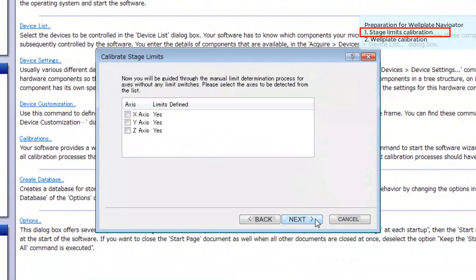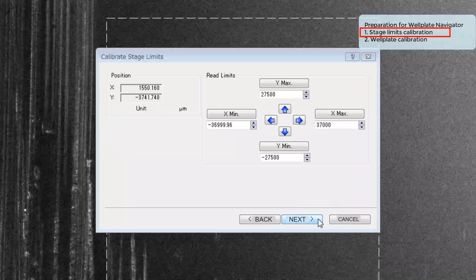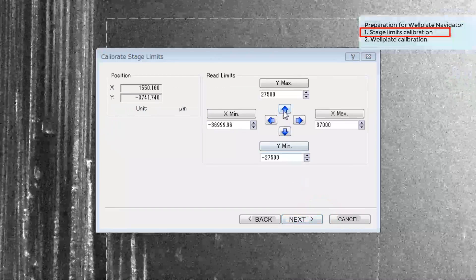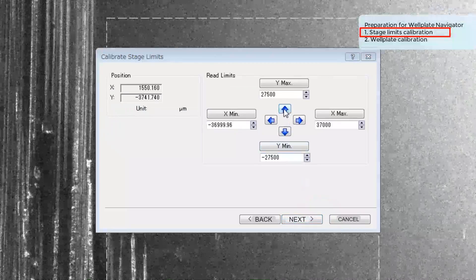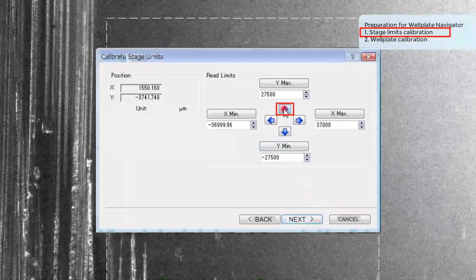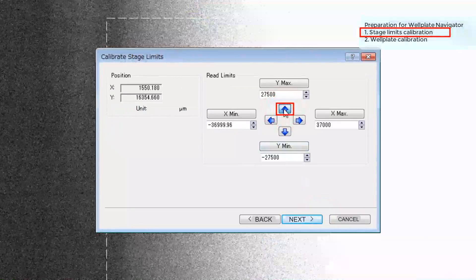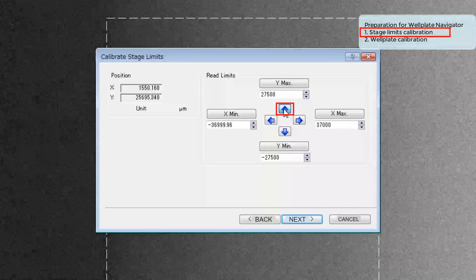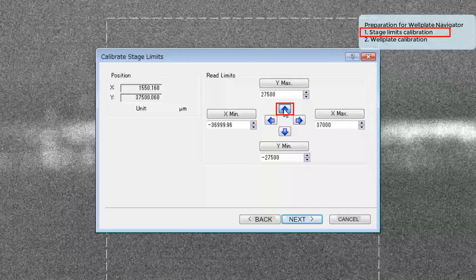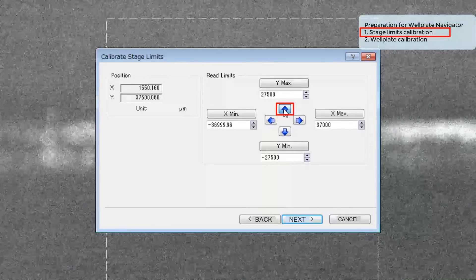Check all the boxes and click Next. Now we can set the XY limits of the stage in the software. Let's start with the maximum Y value. Continue pressing the arrow button until the stage reaches its mechanical limit, then click Y Max.